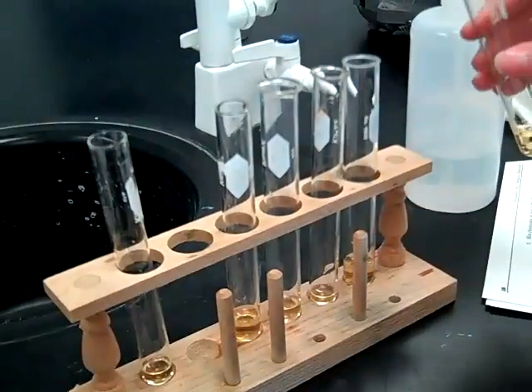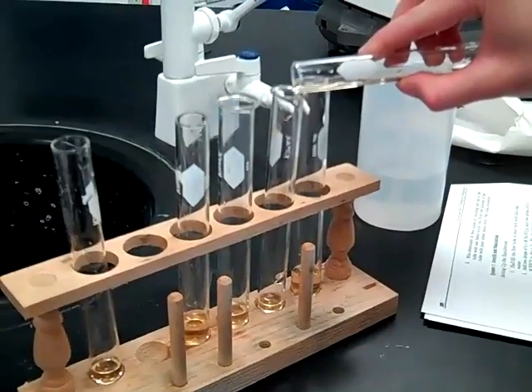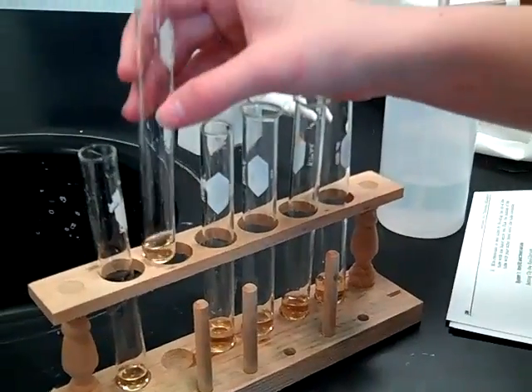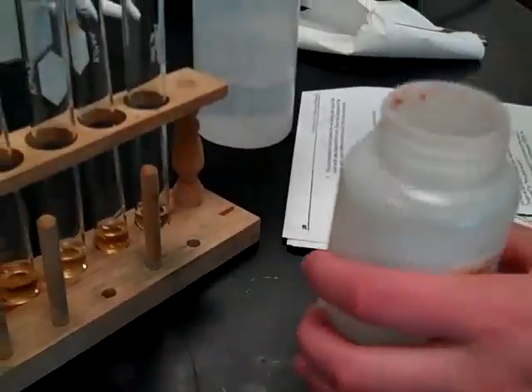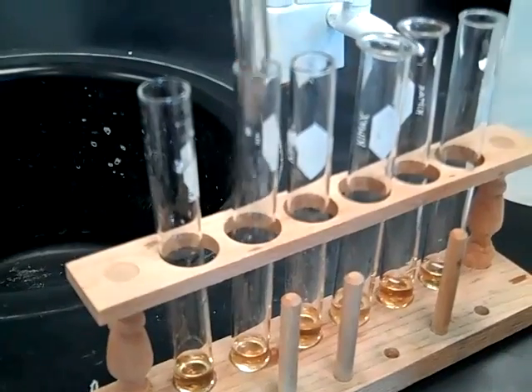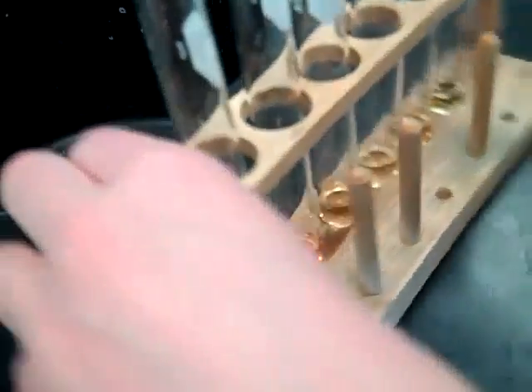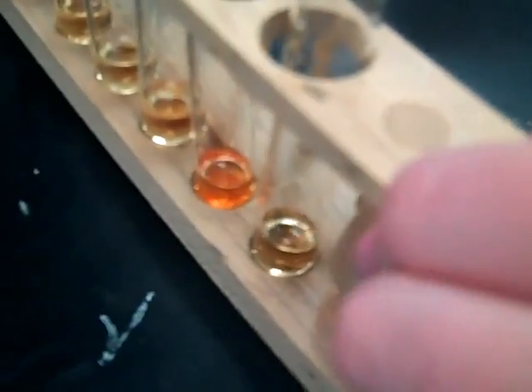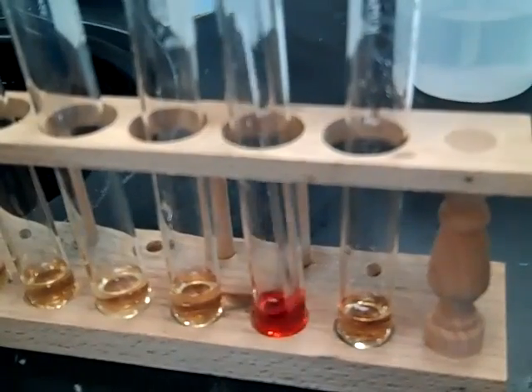So now it looks like it has an hour. Are you getting that? Look at how long it's turning. That is so cool.